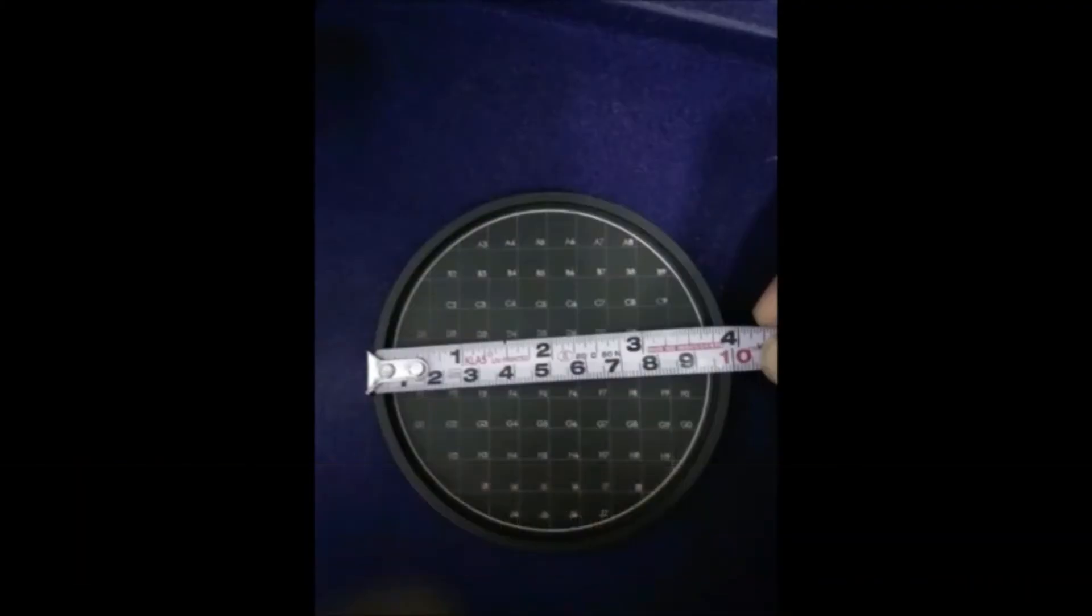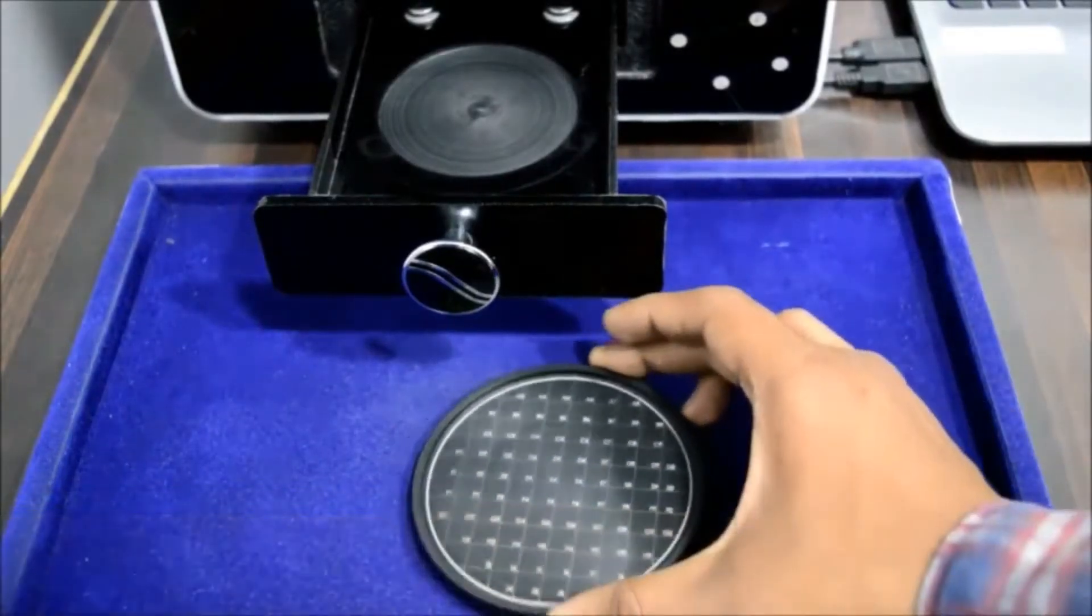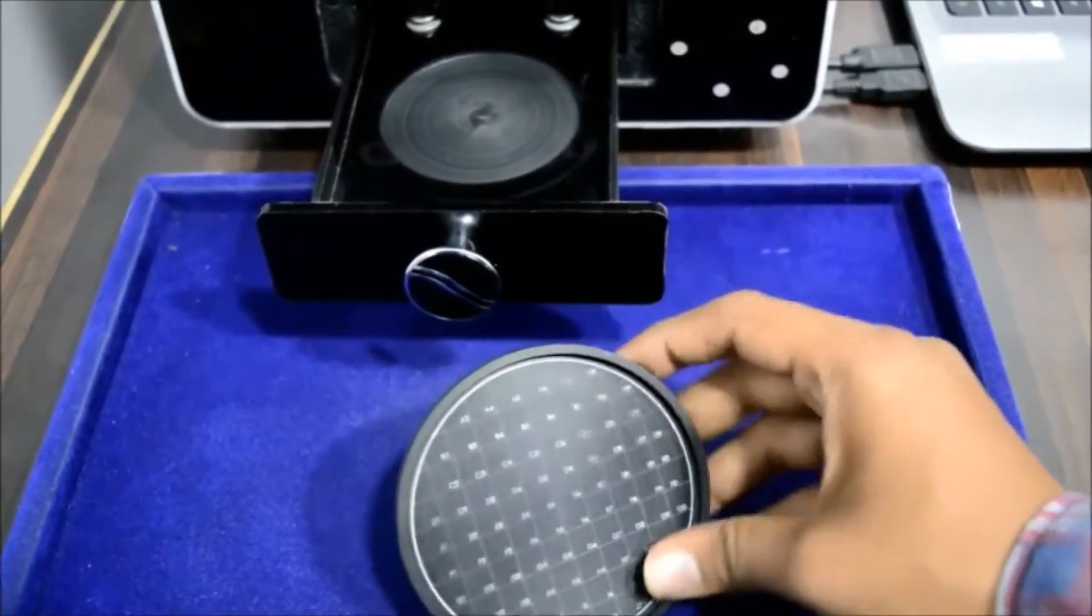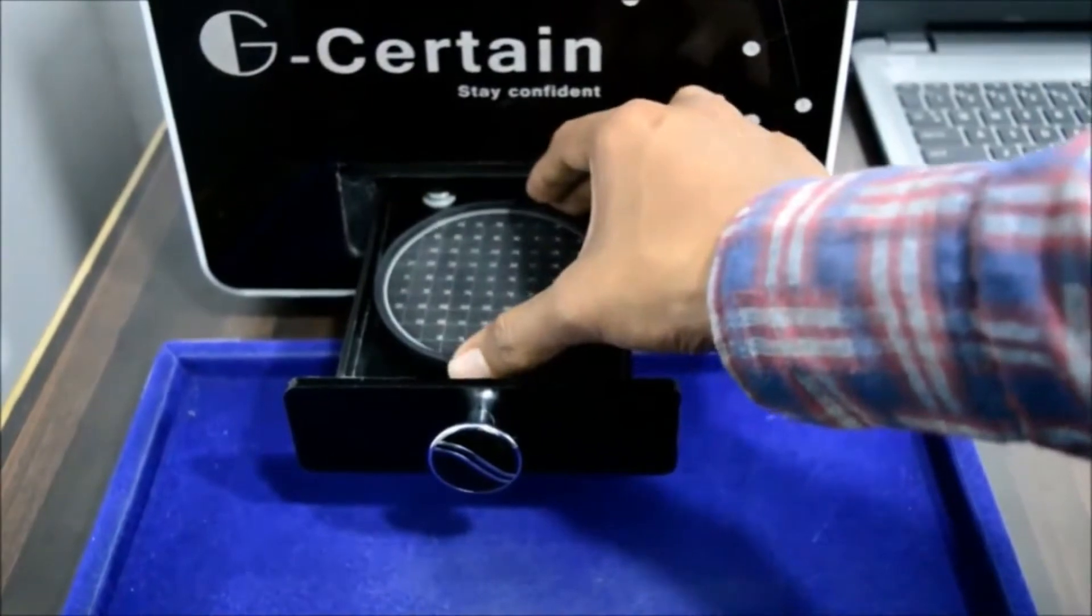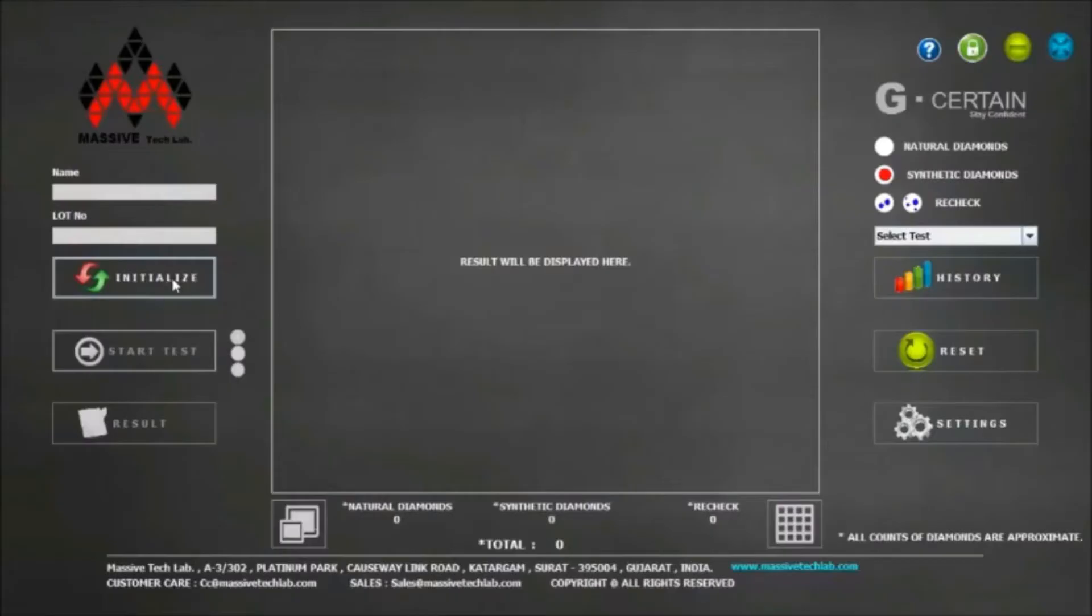Size of circular tray is 10 centimeter diameter. Circular tray can be inserted inside sliding tray after arranging diamonds on it. It has marking on it to easily separate diamonds after scanning. Now let us move to the software part. Click on initialize once after logging into software.